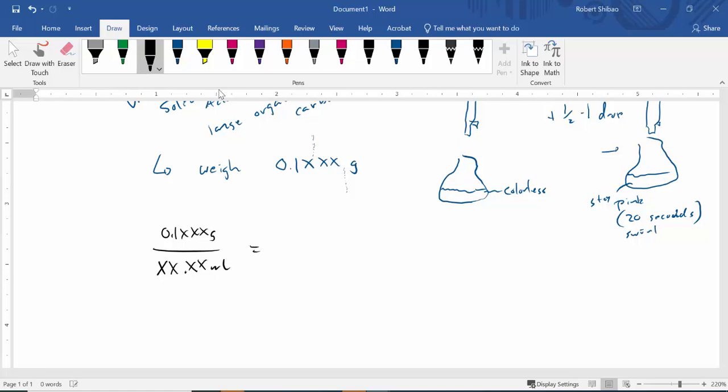And then our optimum sample size is going to be for 35 milliliters. So we're going to calculate Z grams, this is the optimum, to titrate to 35 milliliters. Right on. And so get as many digits, and then we're going to weigh this amount on the balances there.